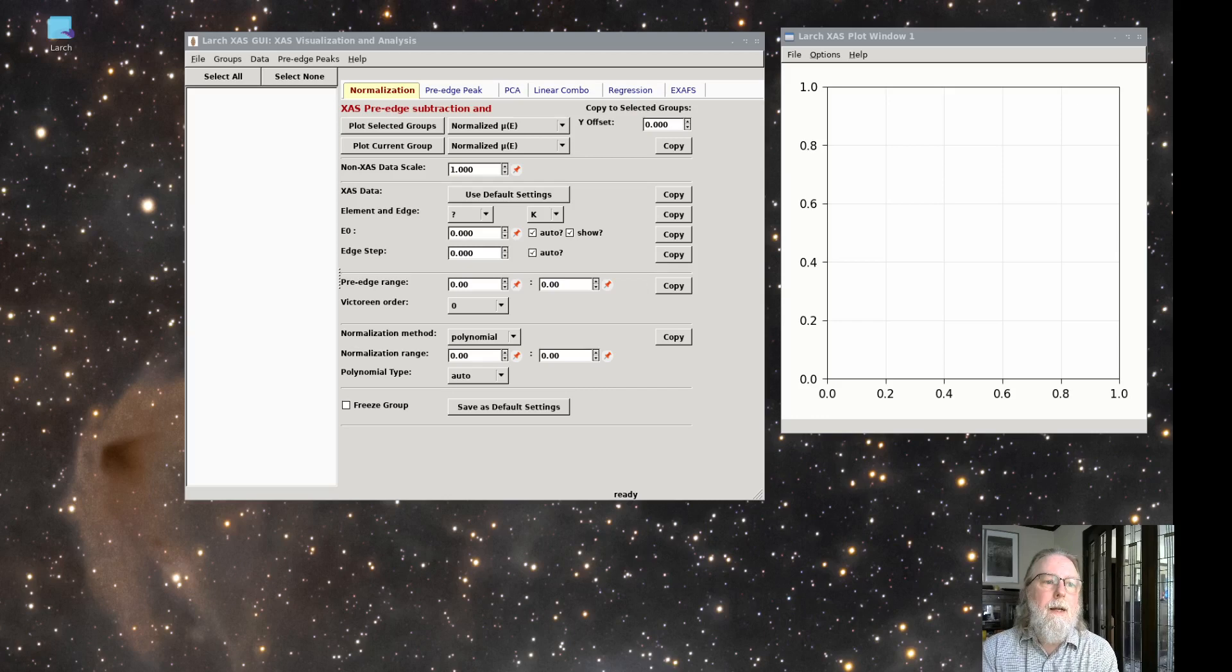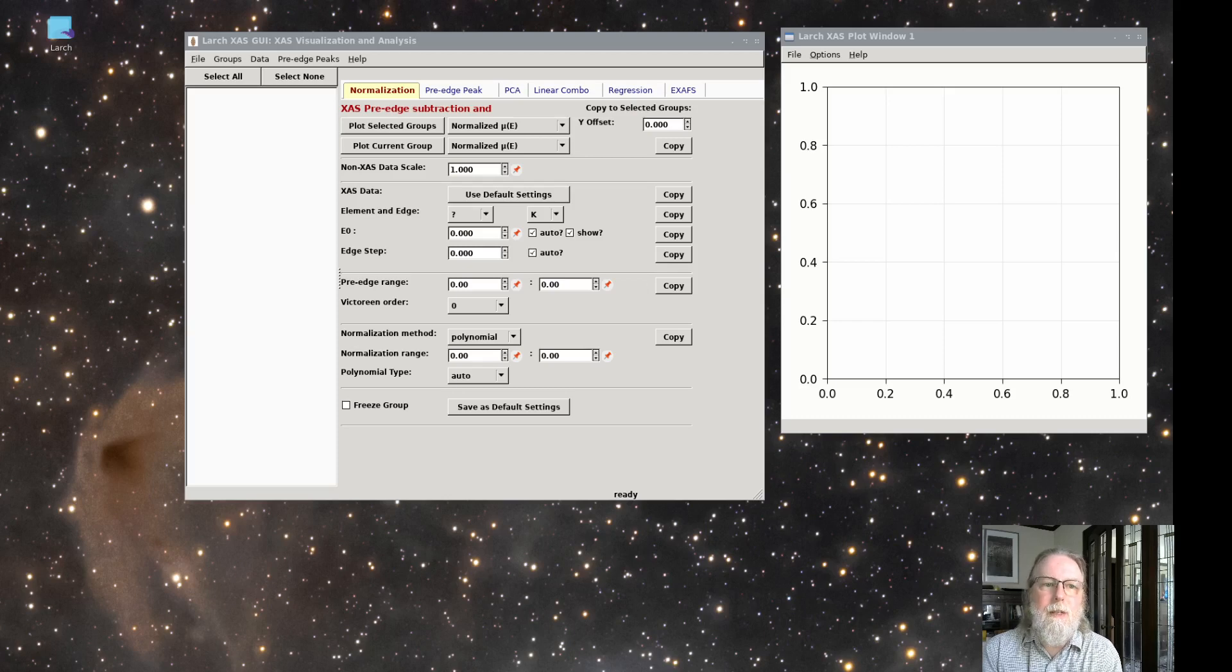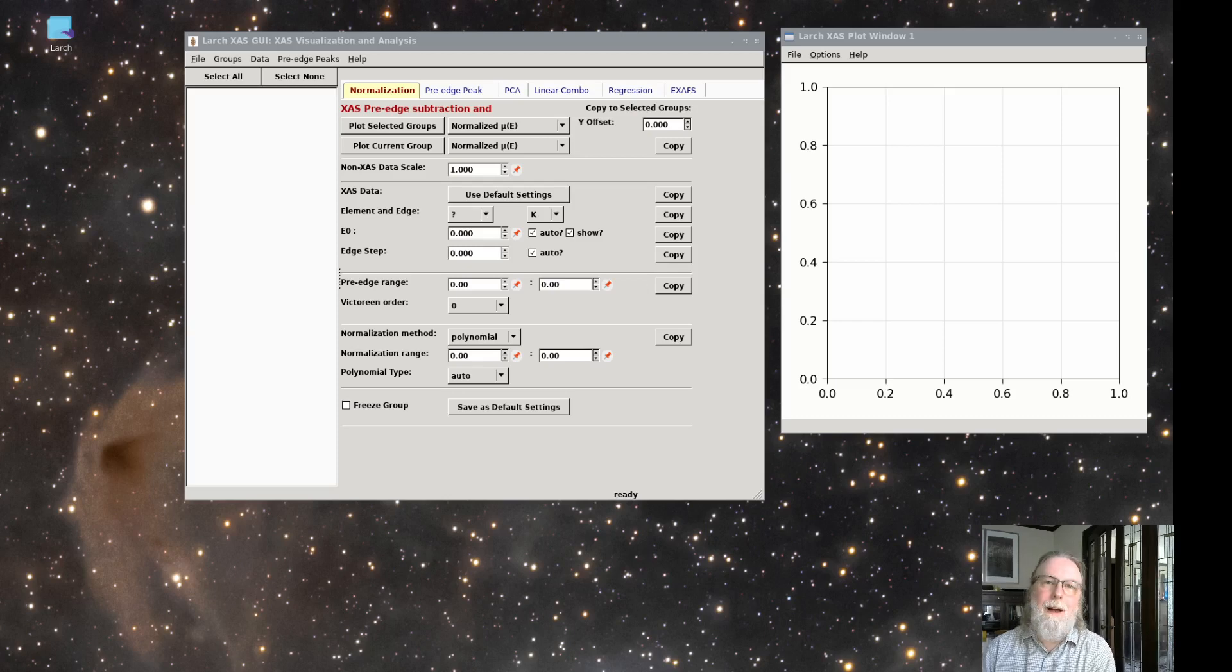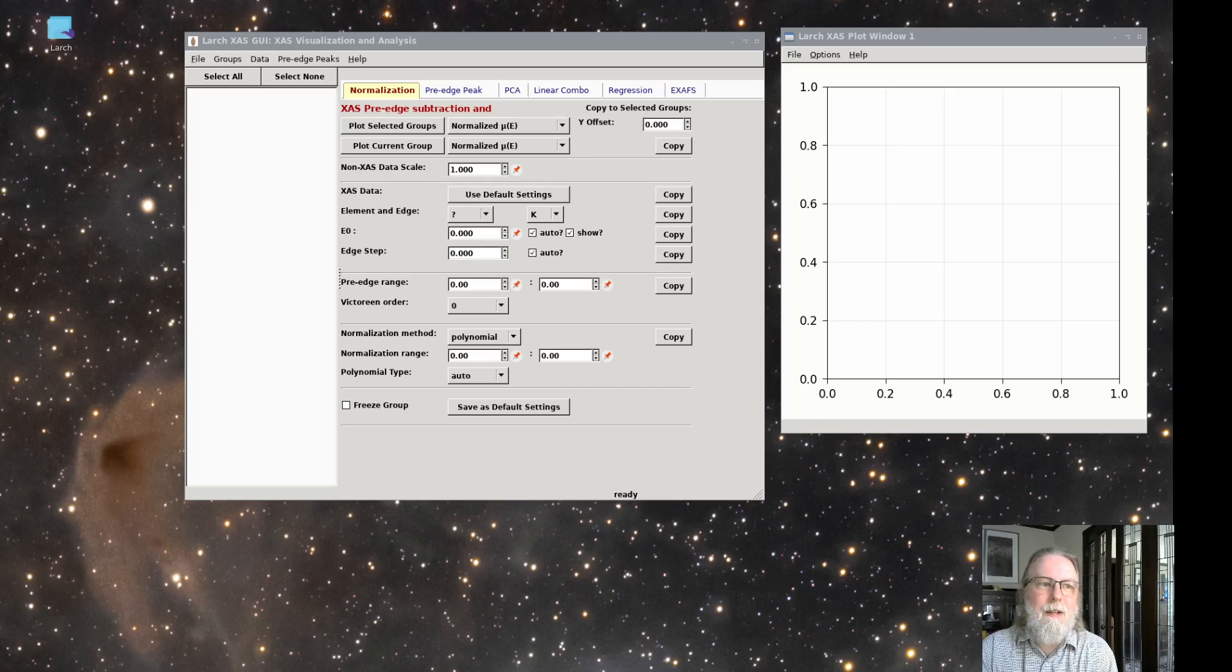In this video, we'll show the normalization processes and go through a few examples that might give you some ideas for how to better use these methods for your data. Hi, I'm Matt Newville, and this is part of the video series for using Larch for XFS analysis.